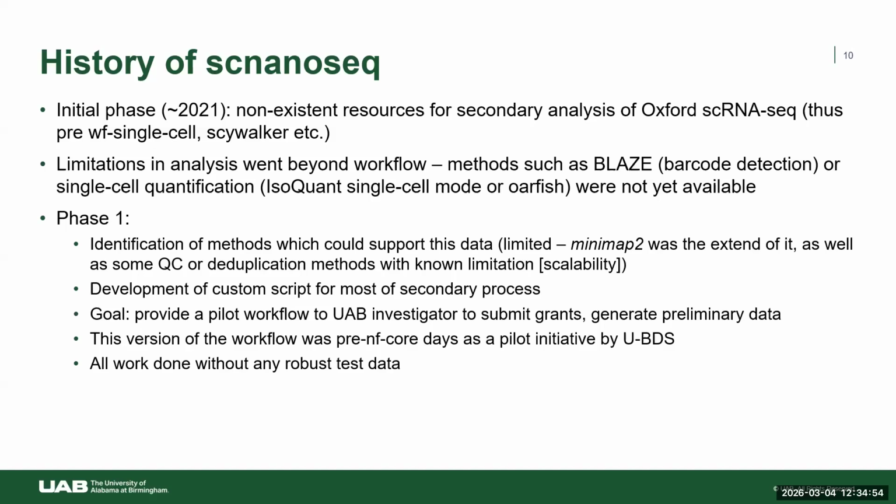that for this initial workflow because we had no other options. And again, the goal of this first phase was to provide a pilot workflow so that UAB investigators could at least run their preliminary data. If available, we helped individuals with troubleshooting their original analysis. And this was also important in pre-nf-core days. At this time, we weren't thinking about putting this in nf-core. We wanted to, but we wanted to see where the field was going to go first.